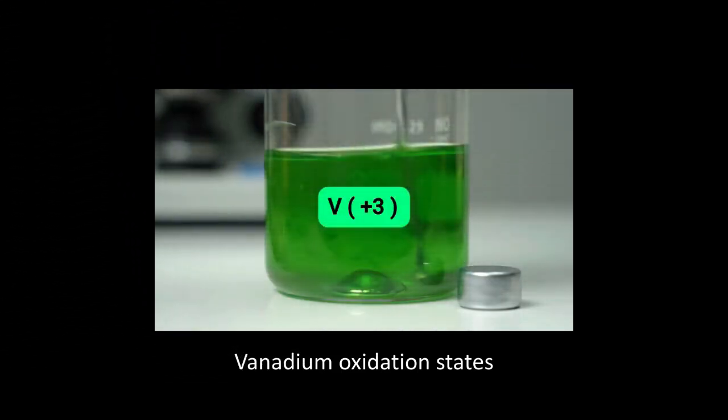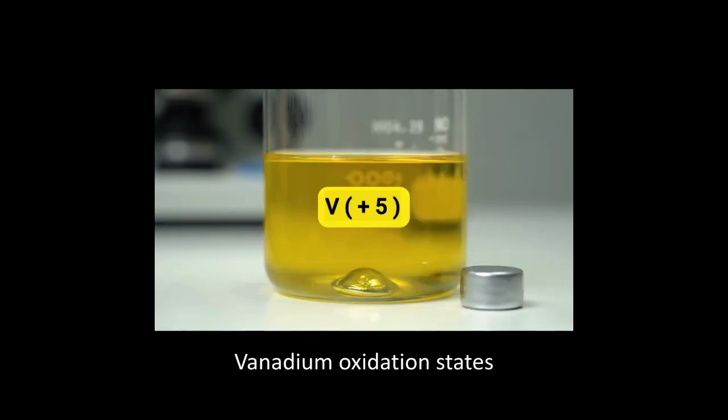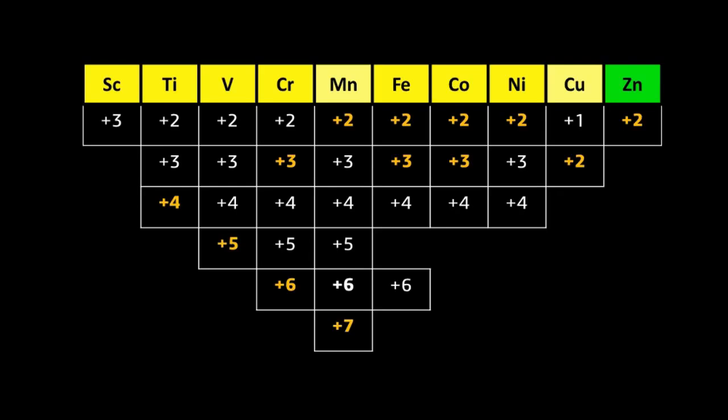Now another cool thing about this reaction is that if I keep it out in the open, the vanadium +3 can actually react with oxygen out in the air and can get oxidized back to vanadium +4 and +5. Now vanadium is not the only element that shows such a variety of readily accessible oxidation states which differ only by 1 unit. In fact, all of the transition metals show such variety in oxidation states.